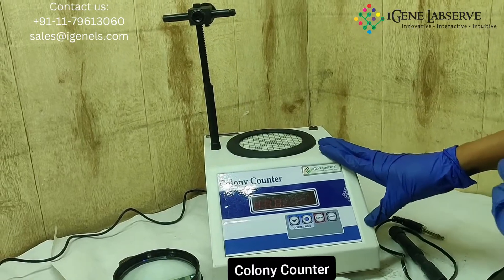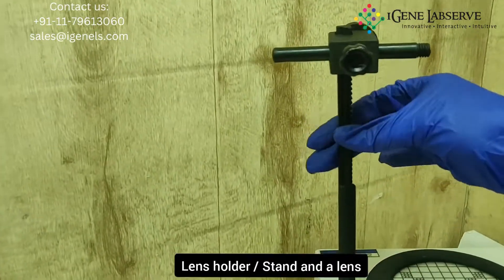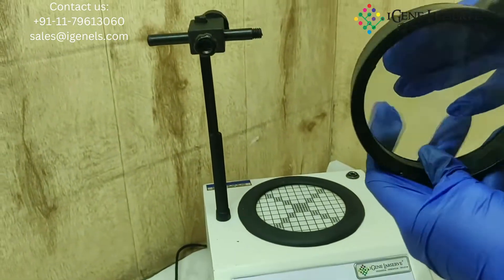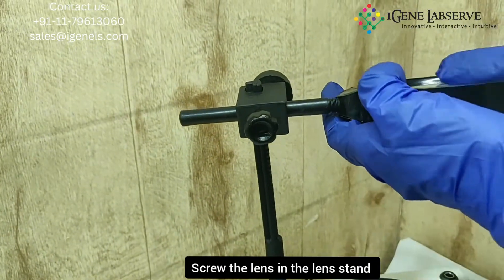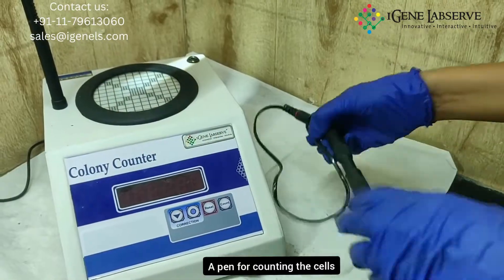This is the iGene colony counter. It comes with a lens holder, lens stand, and lens. You have to place the lens over here by screwing it into this rod.